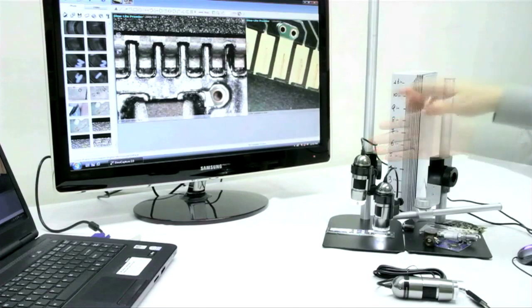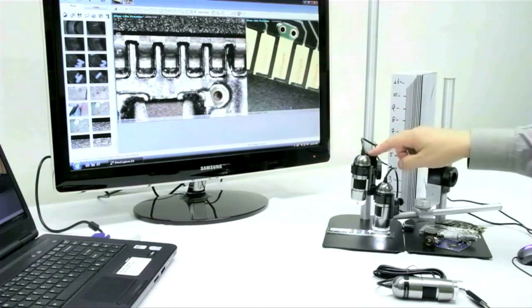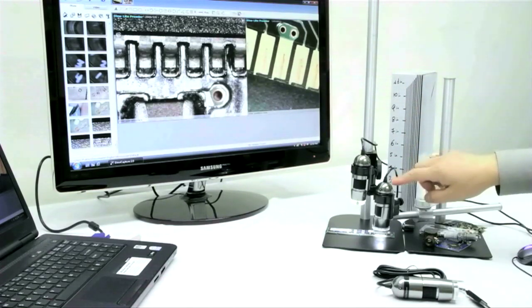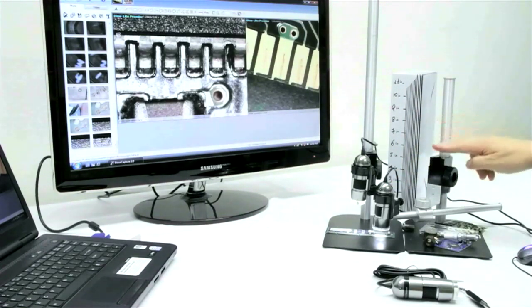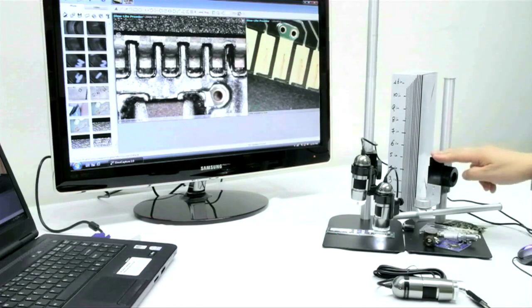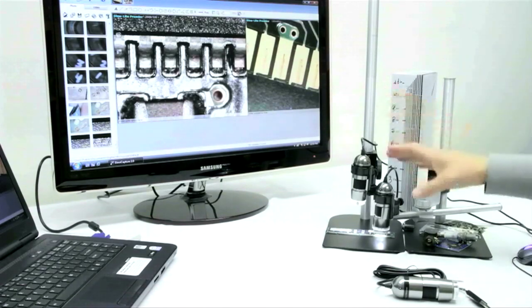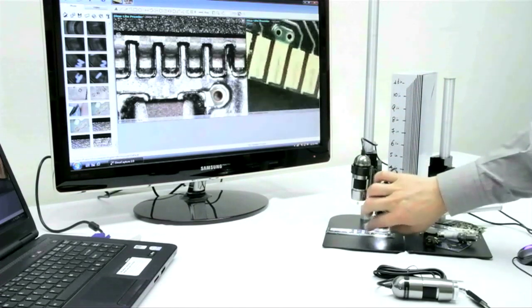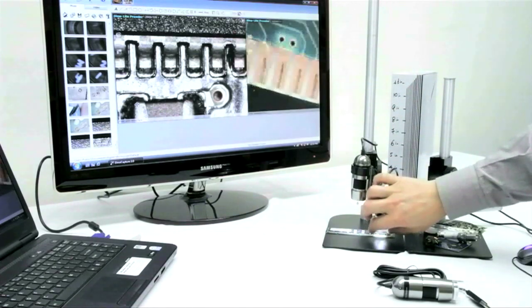For example, the MTL model will hit 10 times magnification at 11 inches away, while the MZTS model will hit 10 times magnification at 6 inches away. As you can see, we are demonstrating the difference between working distance and non-working distance, as well as polarized and non-polarized.